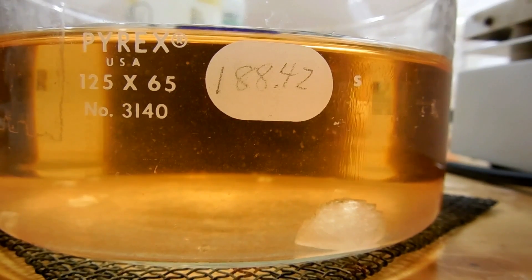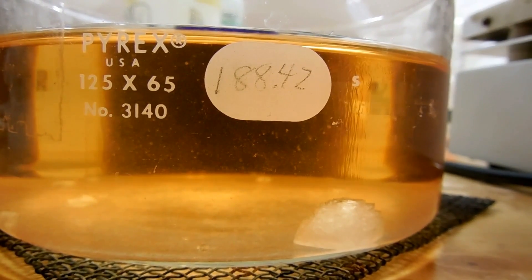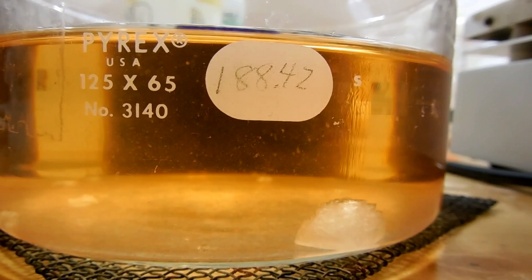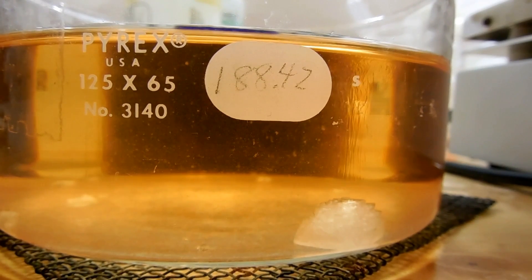Now that the solution's cooled down, we've got some crystals that have started to grow — that's a good sign. I noticed something really interesting: look above the crystal here — you can see there's a stream of something coming off of it, rising up to the top of the solution. My guess is that when the solution cooled and precipitated these crystals, they started to go back into solution, so this crystal is re-dissolving and making a stream of dissolved solids coming off the top. It's really, really cool whatever it is.